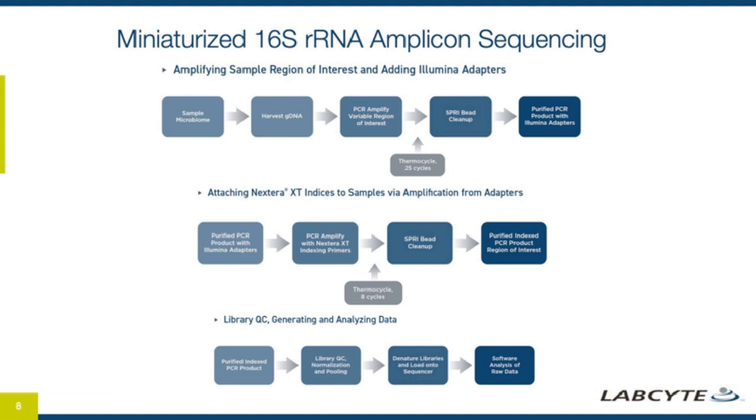And then the Echo was extremely good at pooling all these samples together and normalizing simultaneously. Because the instrument can shoot at 25 nanoliter or 2.5 nanoliter increments, we're able to accurately eject the amount of total DNA wanted per sample so that we reach equimolar amounts.